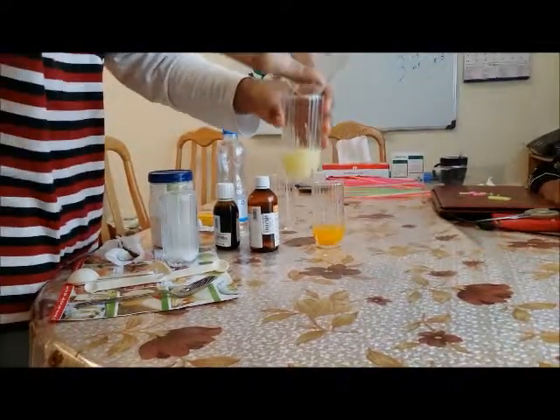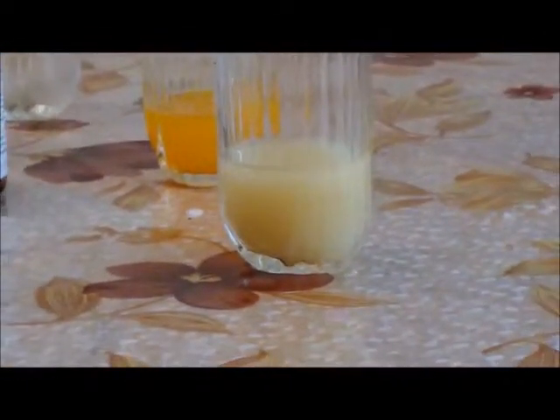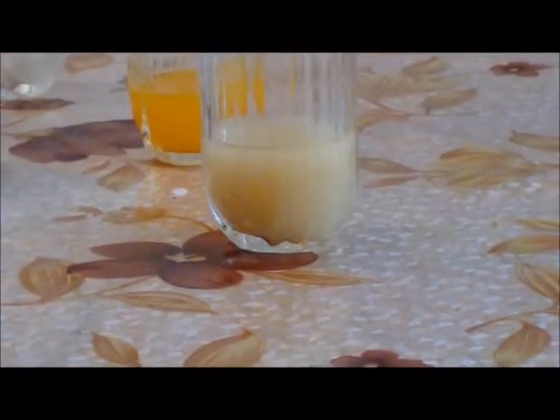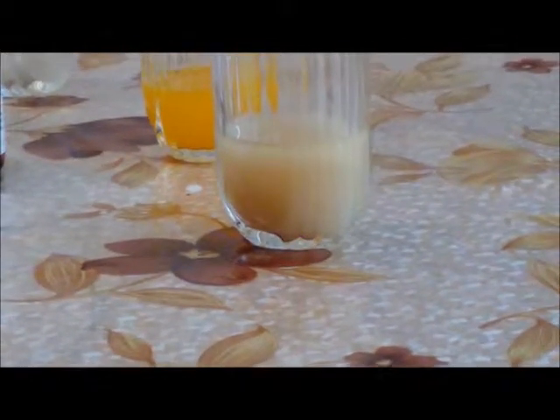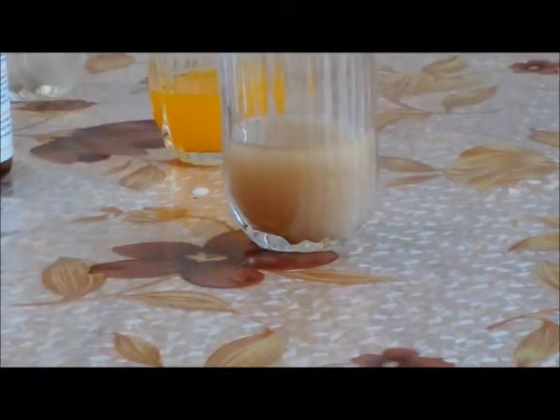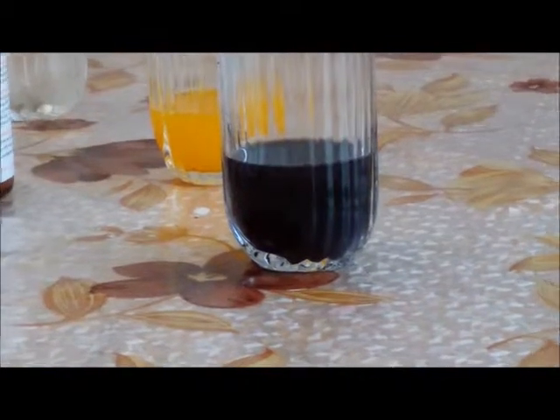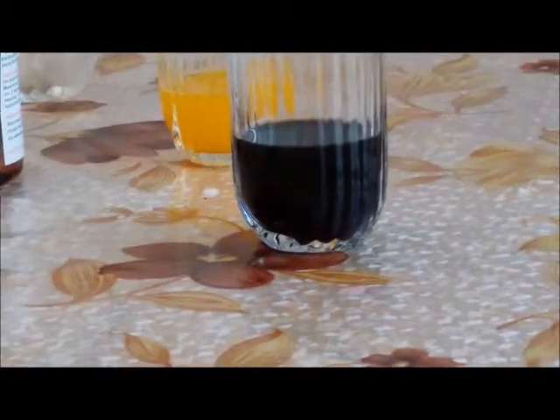That's it. You can leave it aside and just observe it. We are not changing the time of the video. We are not doing anything. Within less than one minute, you will be able to see the reaction. No need to stir, no need to do anything, and see the color changes directly into blue-black. This is called the iodine clock reaction test.